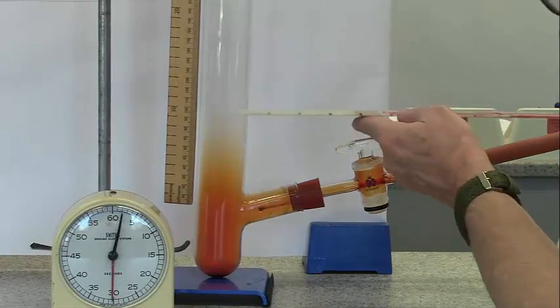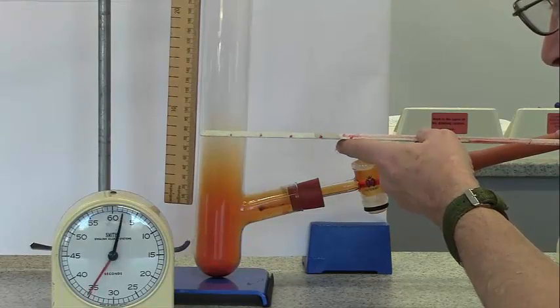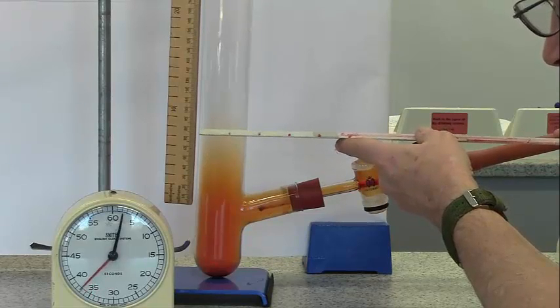After 1 and a half minutes, it's probably got to about there - around 7 and a half centimetres.